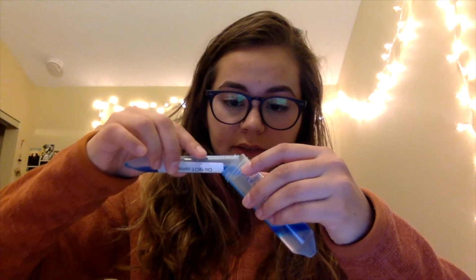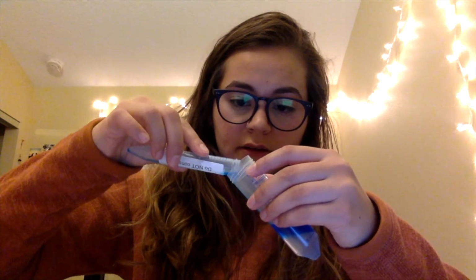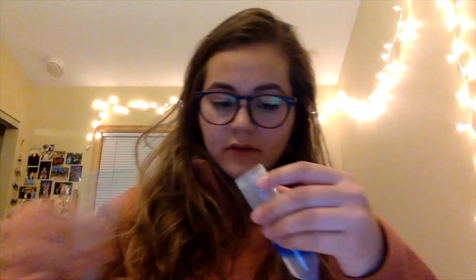Let's not disrupt our DNA. So very gently. All right.